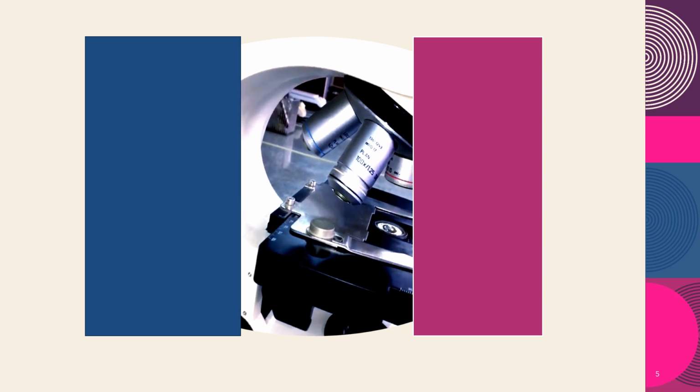It puts the specimen into focus. After putting the specimen into the initial focus, the fine adjustment knob is used to make the image sharper or clearer. So that's the function of these parts of the microscope.